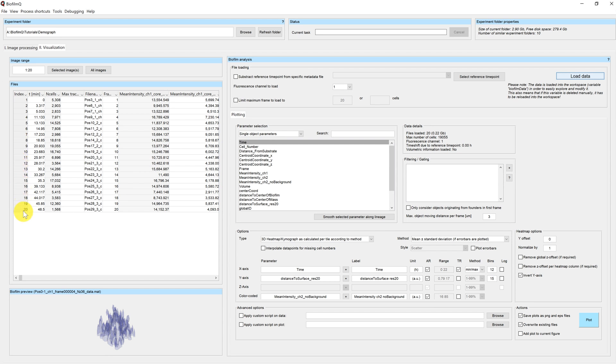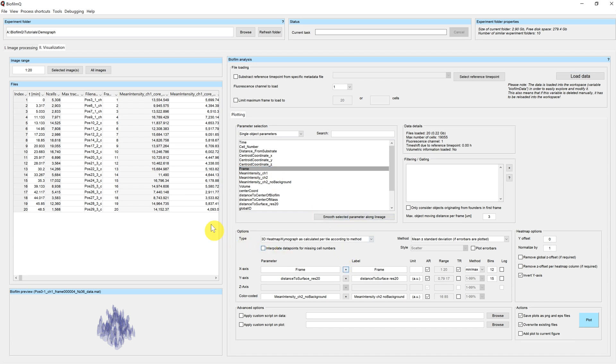And the position of the biofilm, or the index of the biofilm, which is shown here, is represented by the parameter frame. So frame in this case goes from 1 to 20.